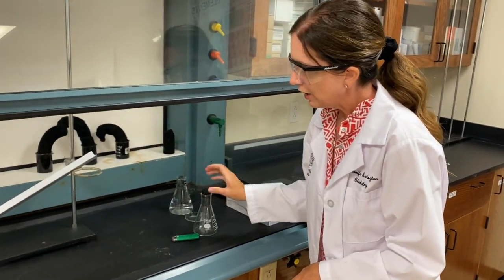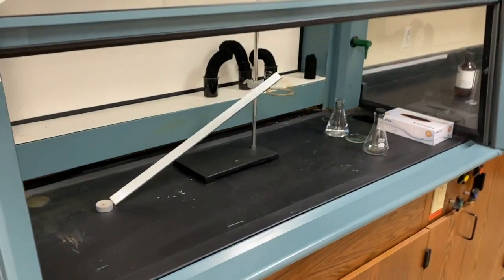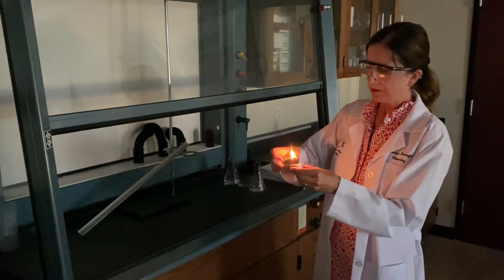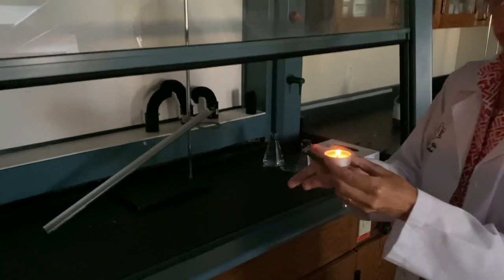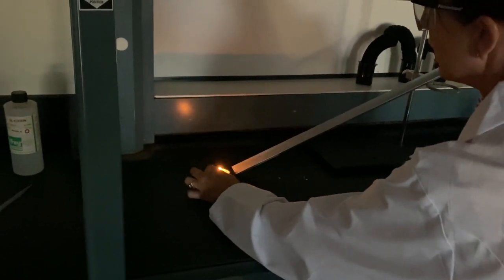Over here I have my little tea light and I have a ramp. I think for this next part we should turn the lights off. So I'm going to light my tea light. And if it's your birthday, there's your candle — happy birthday. I just had a birthday, but I stopped counting.